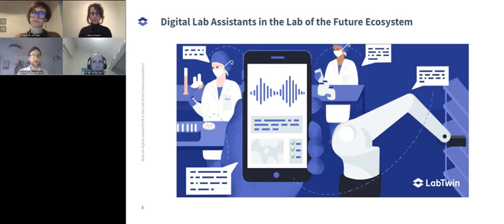And of course, now you can just have a human sit down there in front of Excel and type all of that down, which is super tedious. And no one wants to do it, meaning you need smarter ways to do it. And that clearly gives you already an ROI because the point is, either you buy a machine and you shift the human capacity from doing the pipetting step to tedious computer work. So really to gain something, you need to take that away. And then you clearly have that ROI.